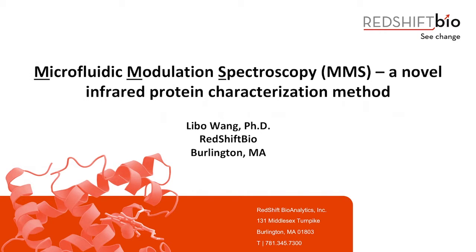MMS was able to detect the non-standard alpha sheet structure, which strongly supports Dr. Daggett's alpha sheet hypothesis towards understanding the toxicity of amyloid peptide aggregates.